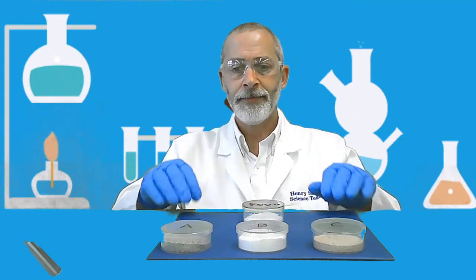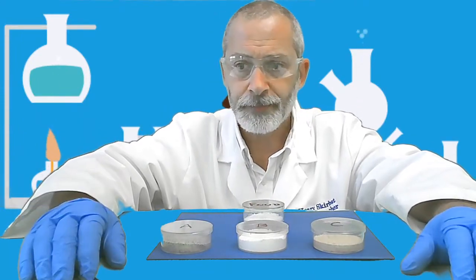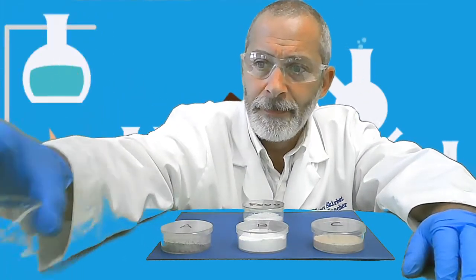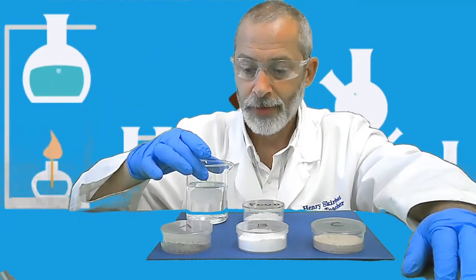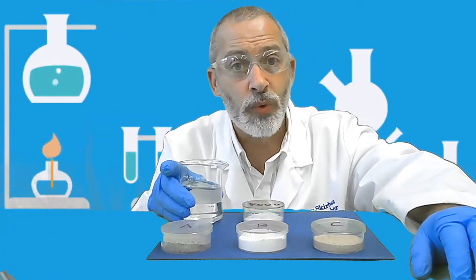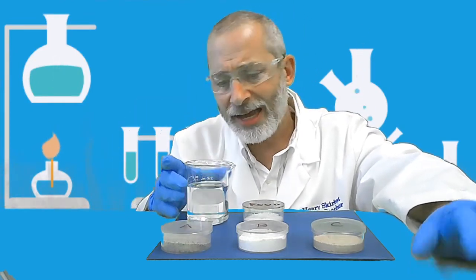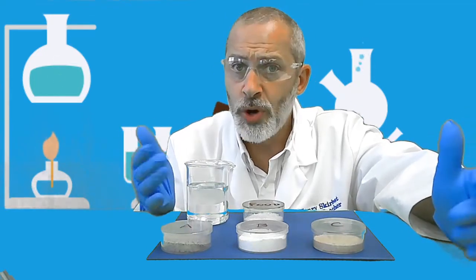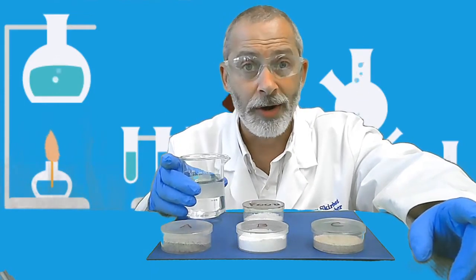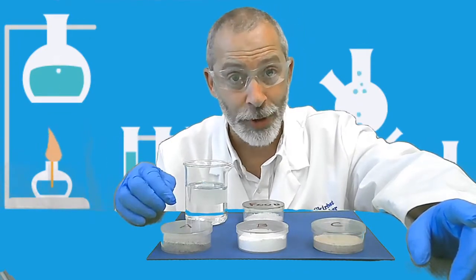Okay, we're back here, and I have some materials in the lab that we're going to use to test these samples. I have water. Water is a basic need of living things, and I've also heated up this water to an appropriate temperature that, at least we're aware of on Earth, most microorganisms prefer. Body temperature. This water is body temperature. So we've got water at an appropriate temperature.